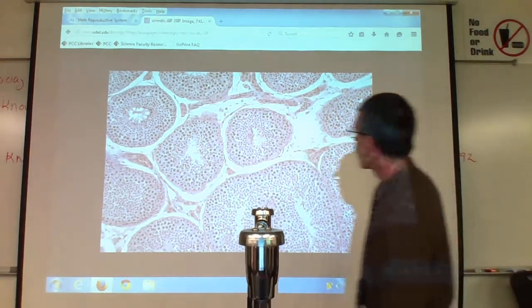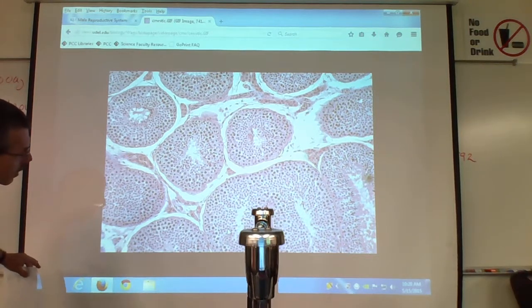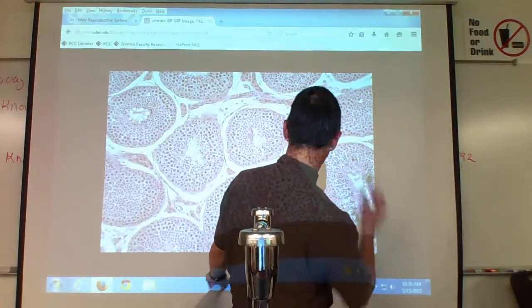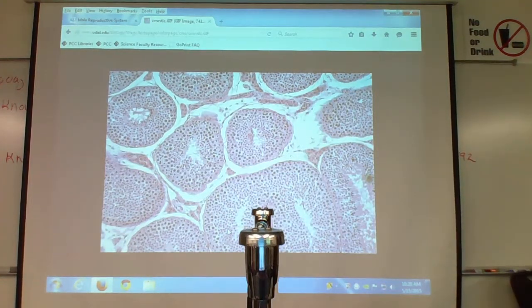Off the top of my head, I can't visually see one. Sertoli cell. Should be one in here somewhere. I just don't see one screaming at me. Yeah, it's hard. I have bifocals on. I have no idea what that is. So will you always find them at the end? They're at the edge, yes. My screen makes it easier, right? Yeah, I don't see anything on top of it.